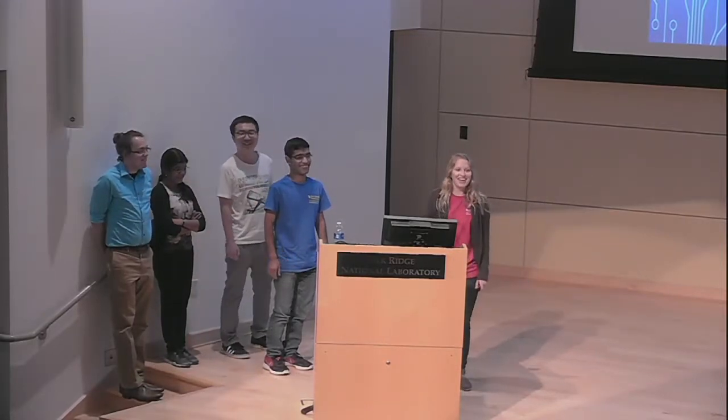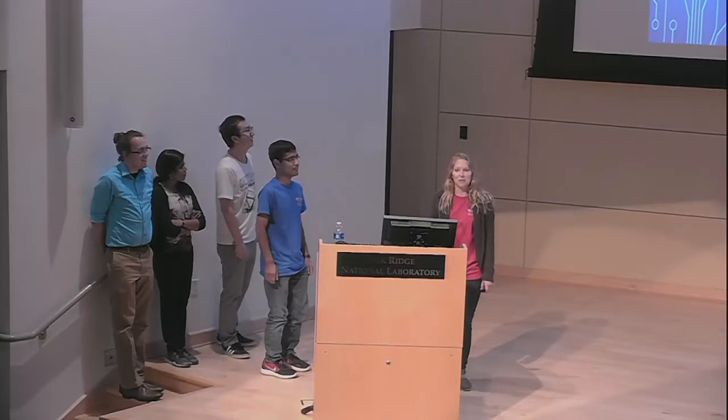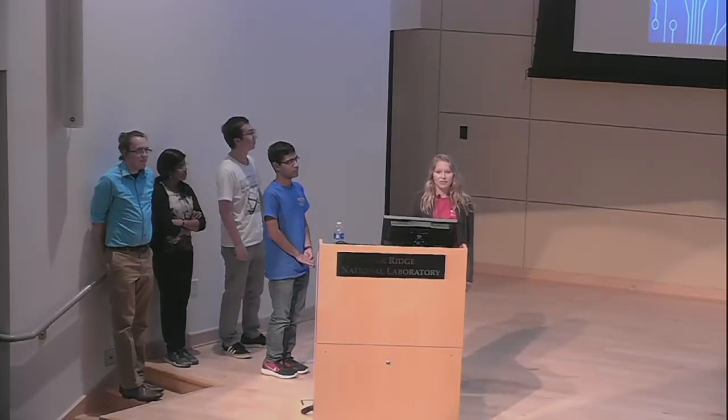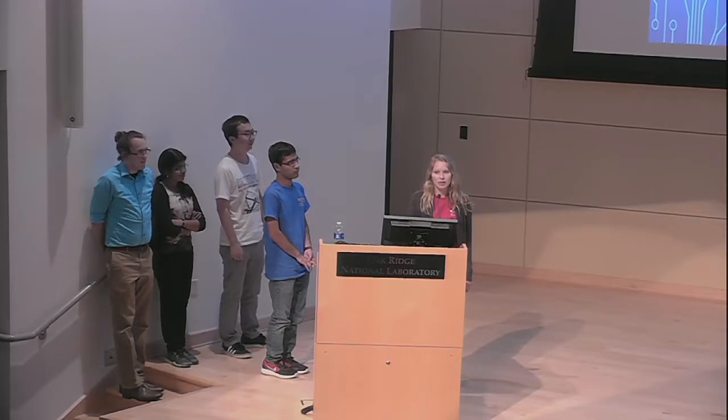And I'm Zach. And today we're going to talk about part 2 of the experiment you just heard, which is the high-resolution powder X-ray diffraction at beamline 11-ID-BM at Argonne.